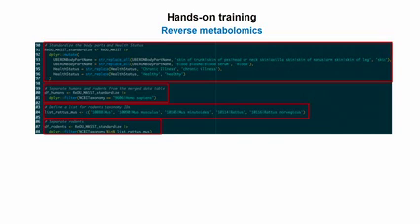So on one side, we want only human data, and on the other side, we only want mice data. So we just filter, and then we keep only the USI that will be matching to human, and only the USI that will be matching to rodents. And for all the rodents, we just, again, aggregate all the different taxonomic IDs that we have in Redu into only a single list of rodents. This is how we're doing it.